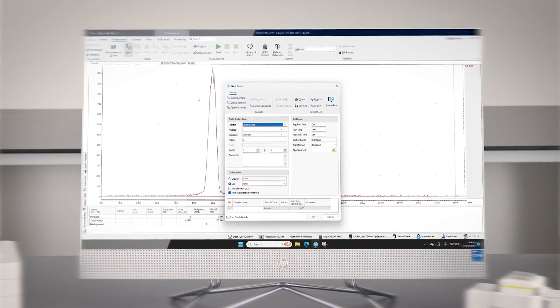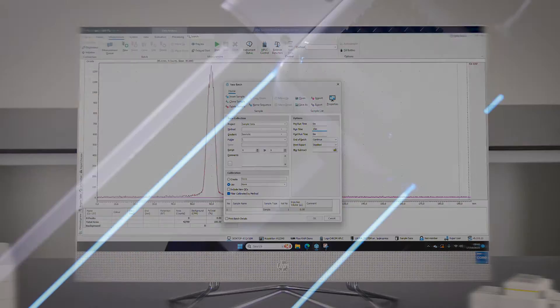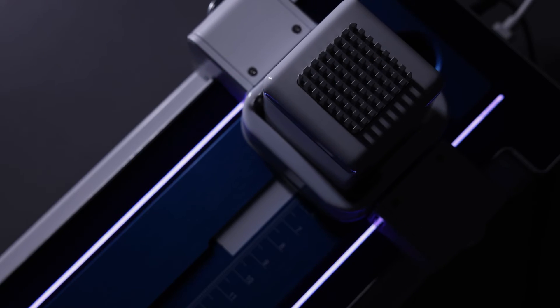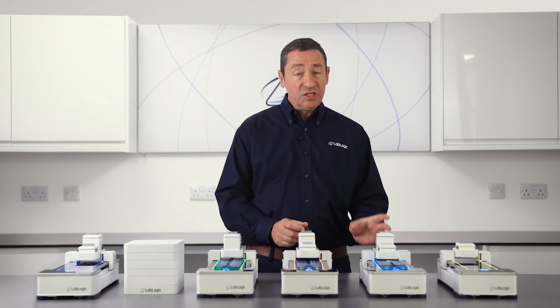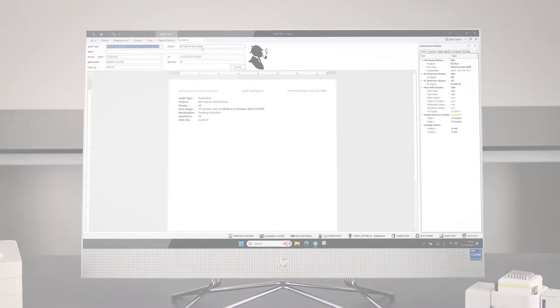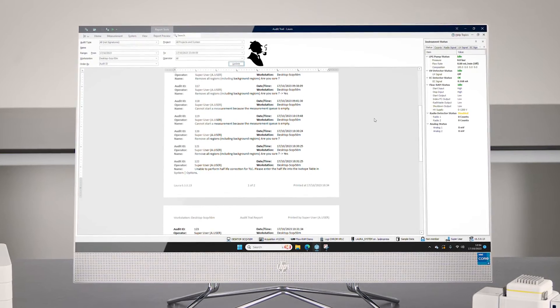Speed, maximum count rates, and scanning time can all be easily configured in the software method. It is important to note that no settings can be physically changed on the instrument itself. This can only be done using Laura software, which features a full audit trail.